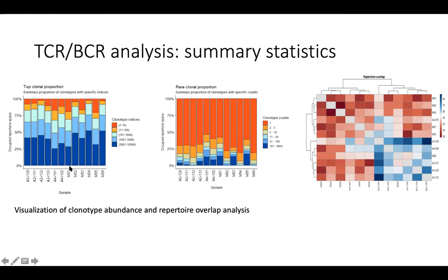This is very helpful because if there are one or two clones that are very dominant, then you would see this red bar stretch across this. So in this case, the top 10 clonotypes in this particular sample actually occupy almost 20% of the entire repertoire. This could mean these TCR sequences are actually maybe immunogenic, and they're recognizing some specific stimulus in the cell.